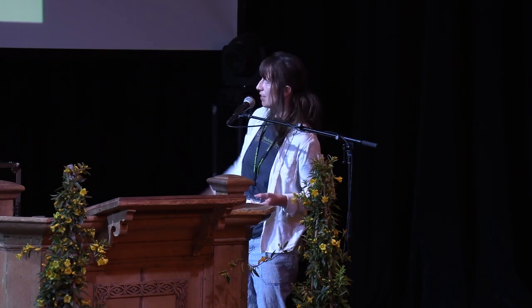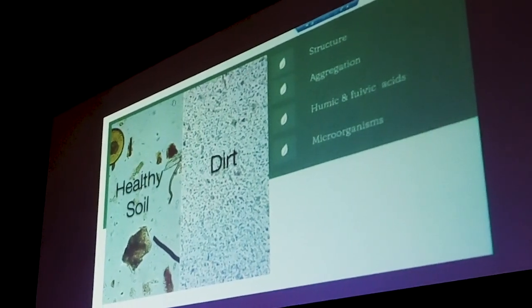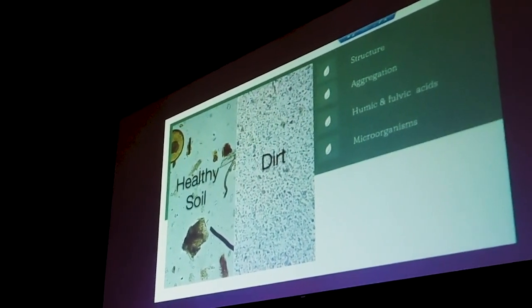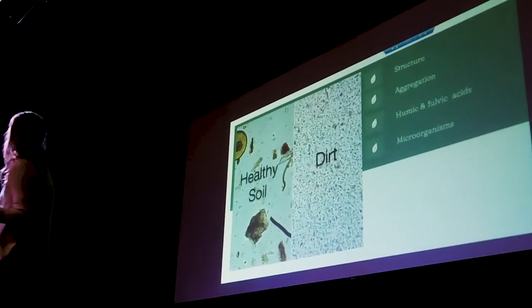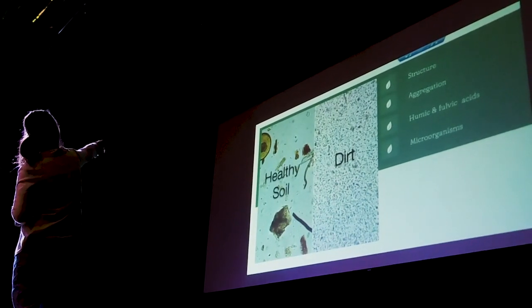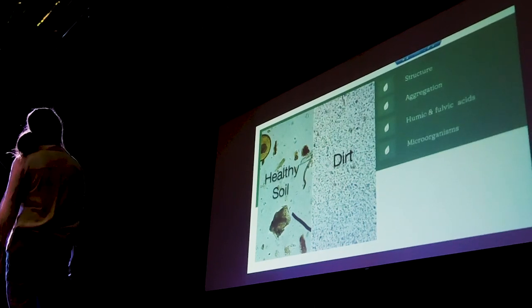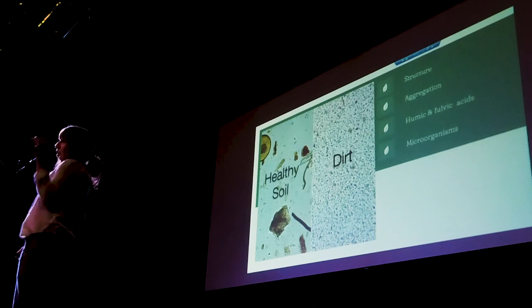Well, on the left-hand side, you put your soil or your compost under the microscope and it looks like that. I can almost guarantee that you're not having a lot of problems with your crop. Because in one view, 1/4000th of a drop, we can see 2 different strands of fungal hyphae, plenty of bacteria, and up there is a predatory protozoan. It's a testate amoeba. We can also see some fungal spores right there.